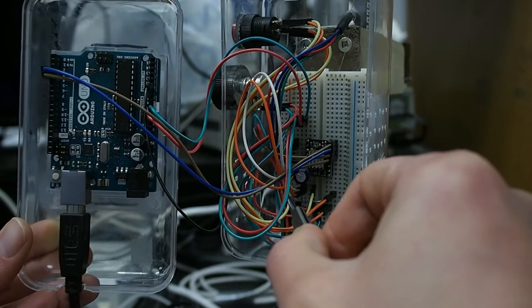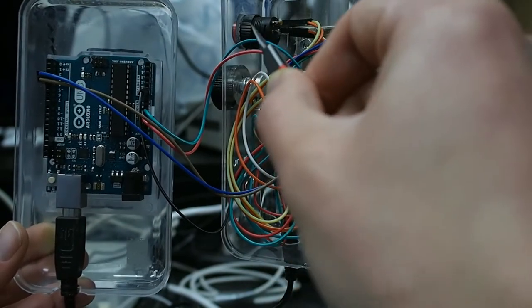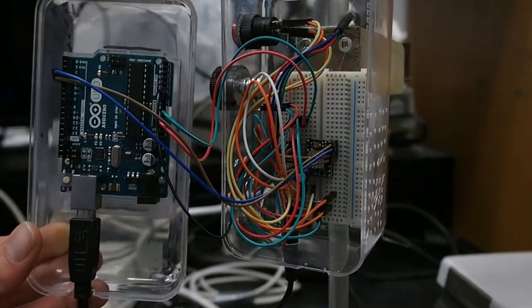Here's a less abstracted view of those components. And so when we turn on the unit, it lights up red to indicate that it is on.